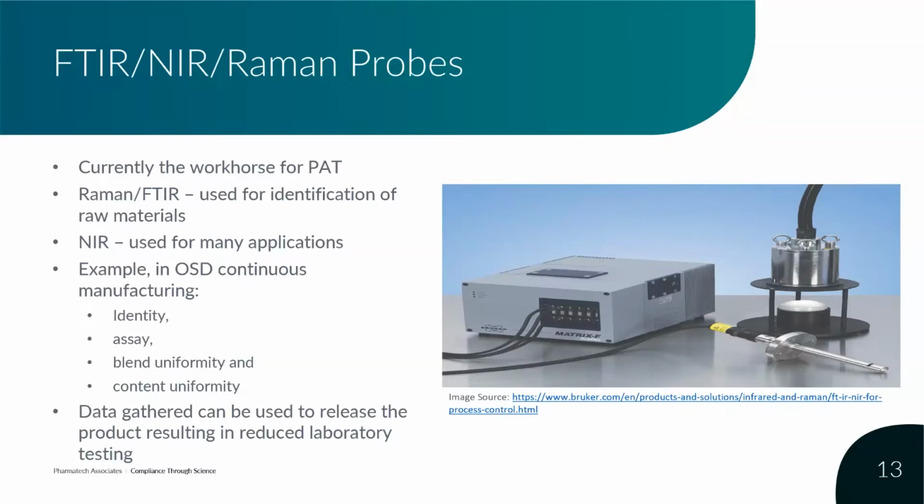And the focus really is on evaluating the absorption or transmission of specific wavelengths of electromagnetic radiation to provide a unique fingerprint for identification.